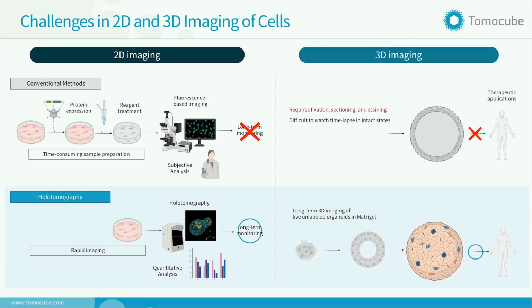And what you utilize is the refractive index distribution, which is highly reproducible data because this is a physical quantity. And you can also retrieve various quantitative imaging parameters, such as protein concentration, volume, and dry mass of the subcellular organelles, such as cells, can be quantitatively calculated.